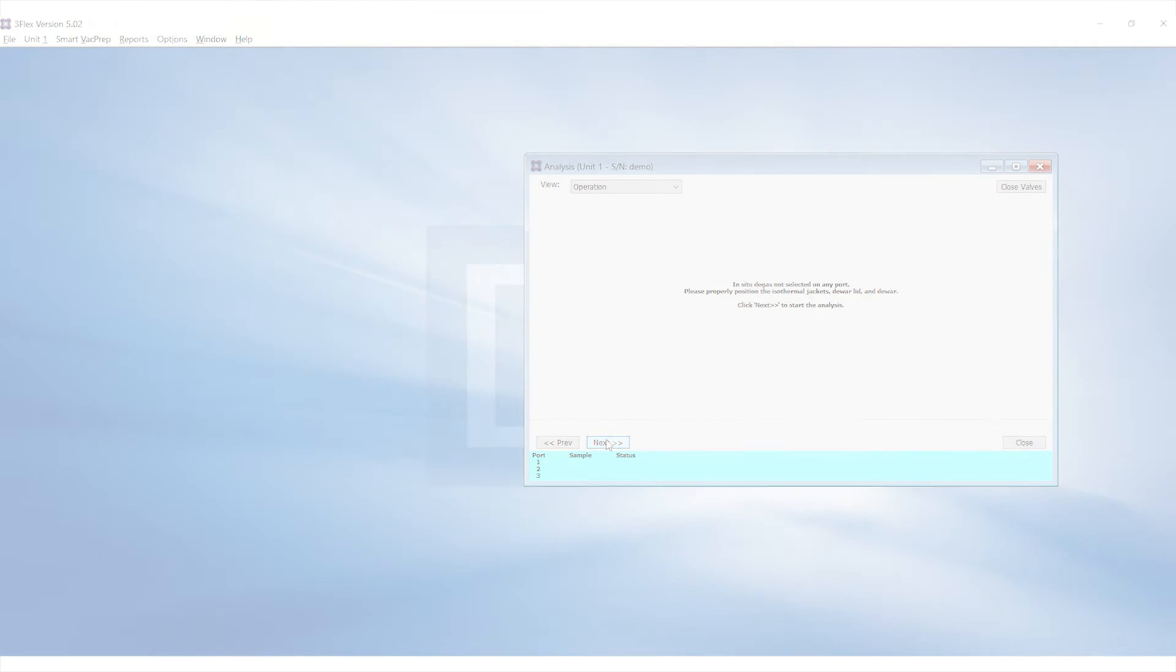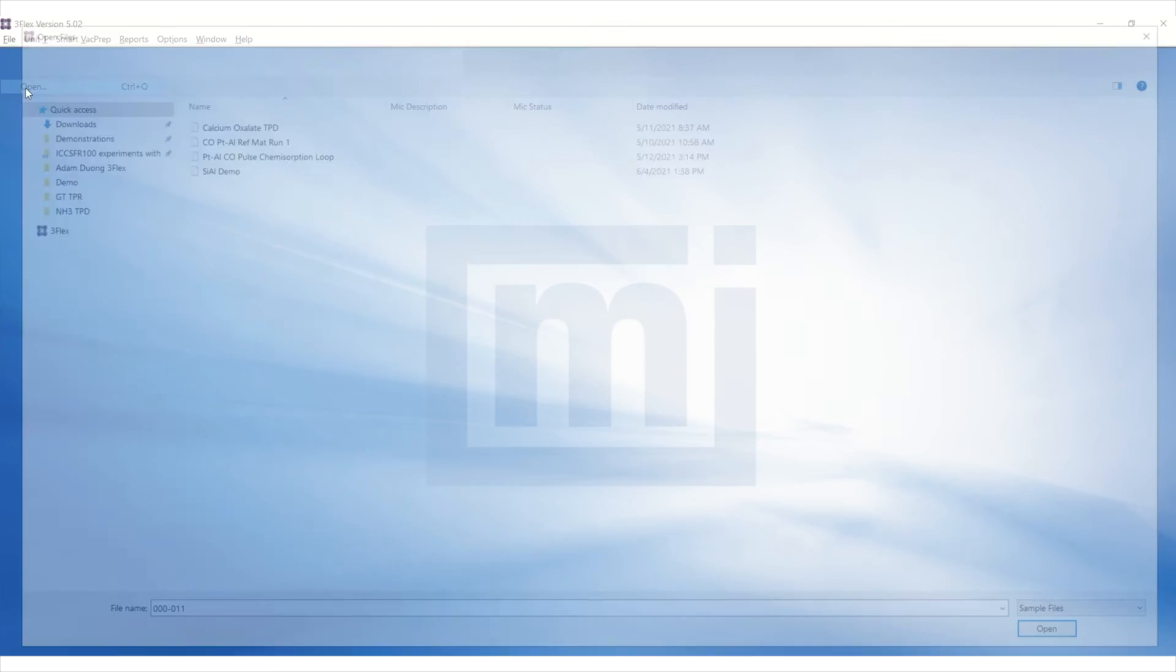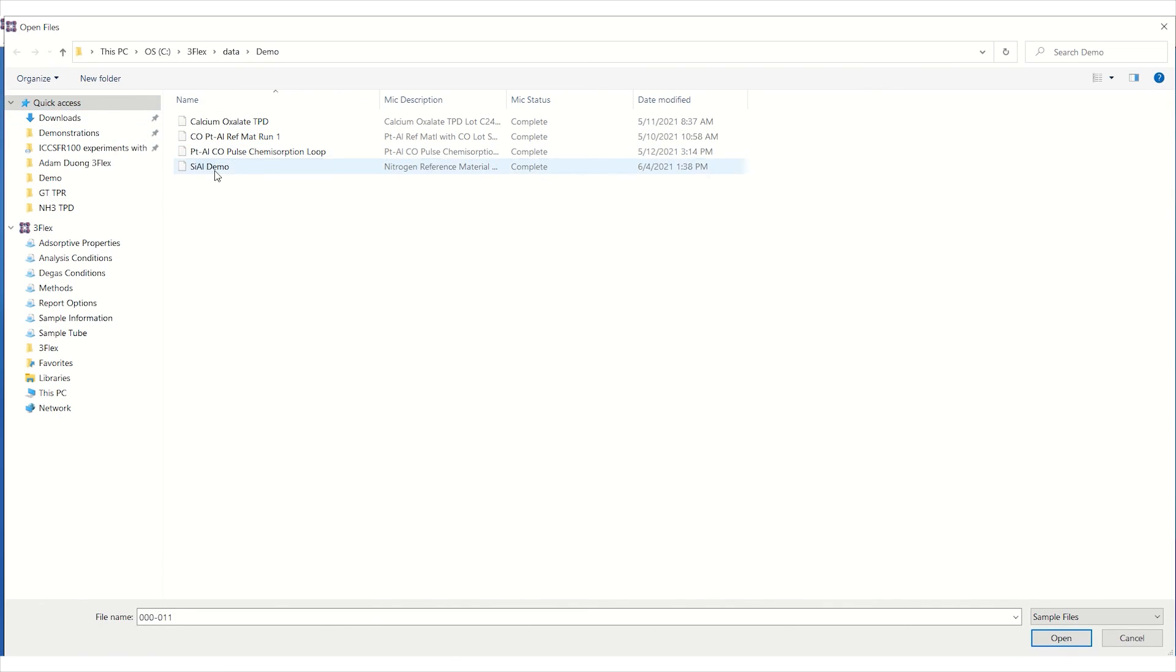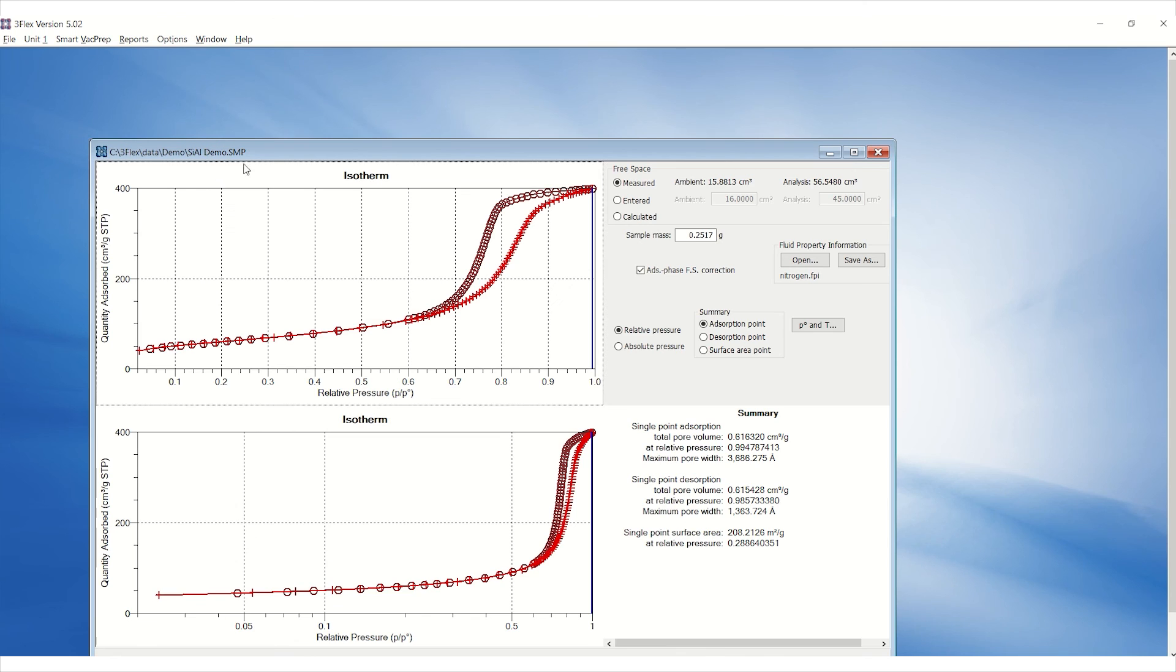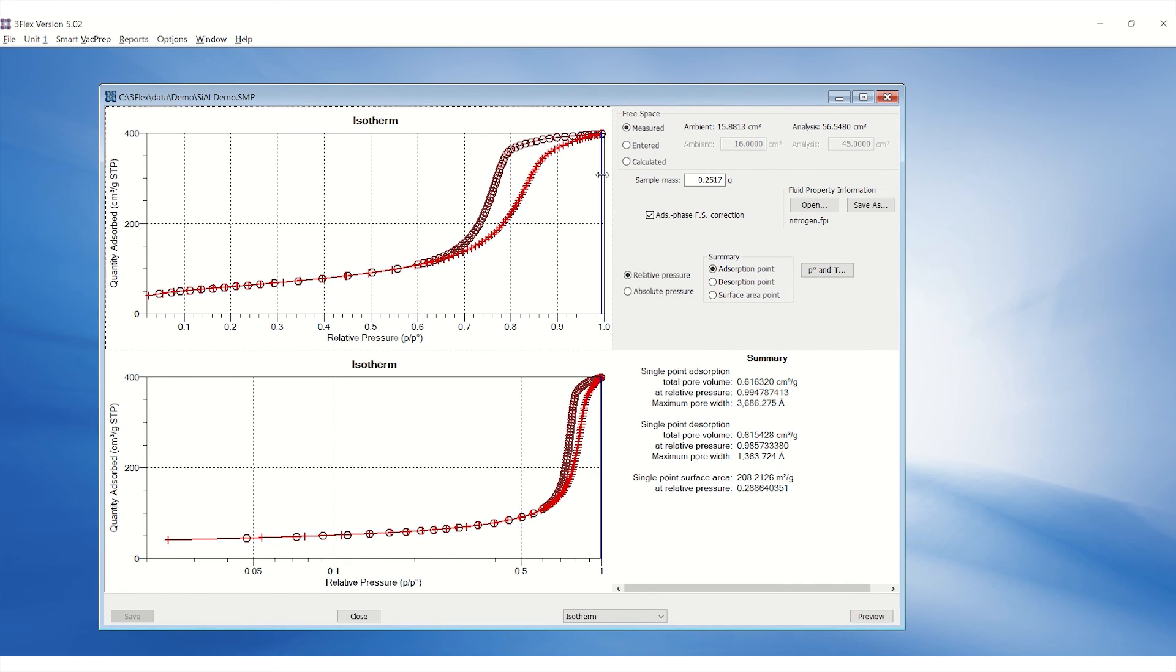Once completed, go to File, Open and open the sample file. On the isotherm, adjust the adsorption point by moving the blue bar to the highest adsorption point.